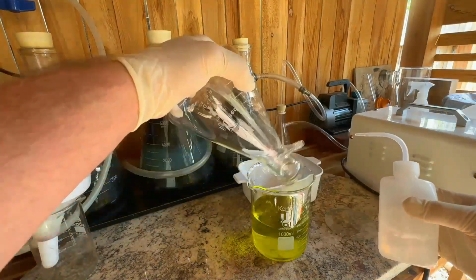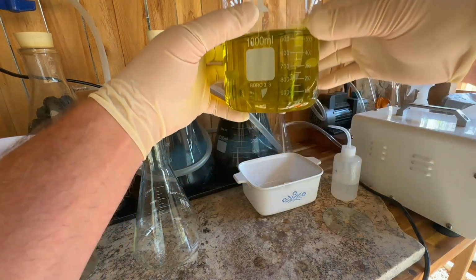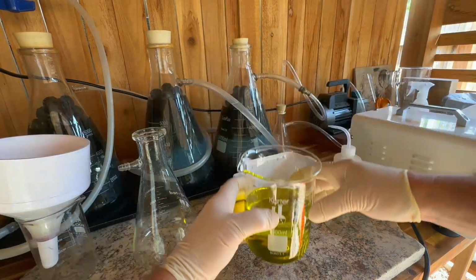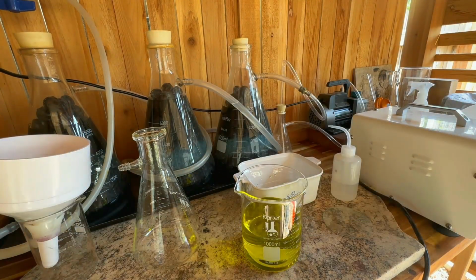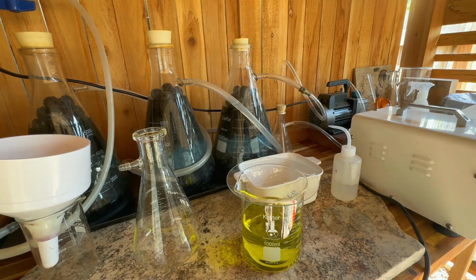This time, if we look at the solution, hold it up here, you can see that is very clear. That is about as crystal clear as I think I was going to get it. So I think we are done with filtering. We're going to cover that up, and we're going to move back over to the hood and drop this gold.